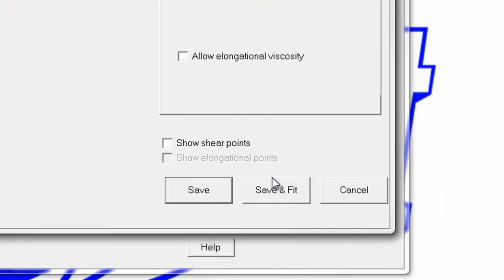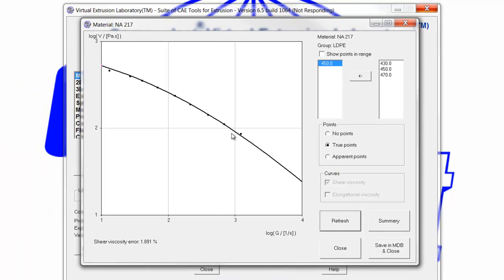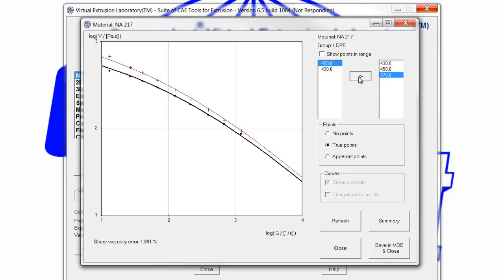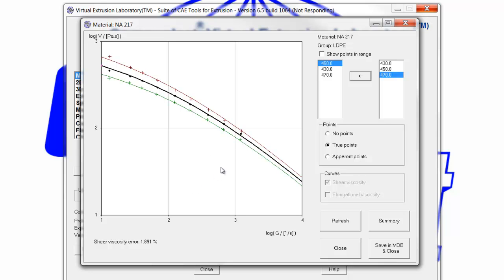Once we've entered all our data, we click save and fit. Here you can see the curve that was fit to the data — it shows just the 450 reference point. We can add the 430 and the 470 to see what the fit looks like, and we can see that qualitatively the fit is pretty good. Quantitatively, the error is about 1.9%, and generally anything less than 6 to 8% is acceptable and means the data was pretty good. If it gets any more than that, there's generally something wrong with the data.